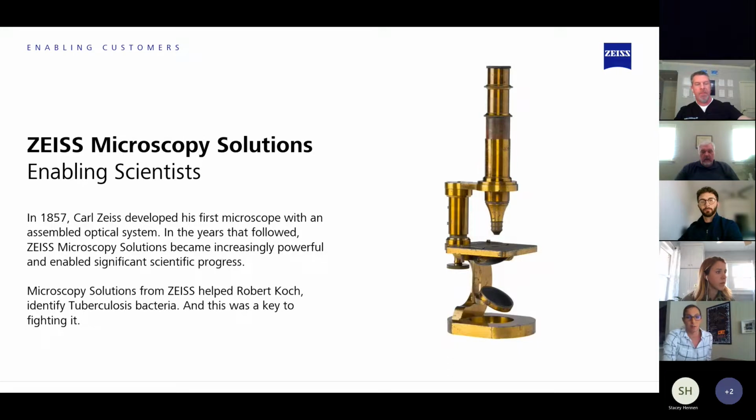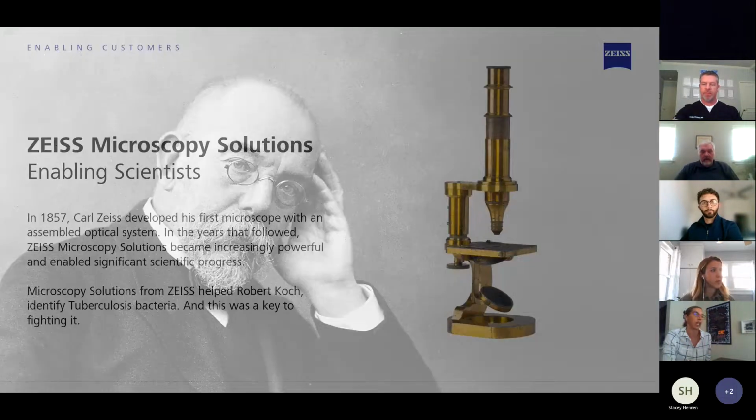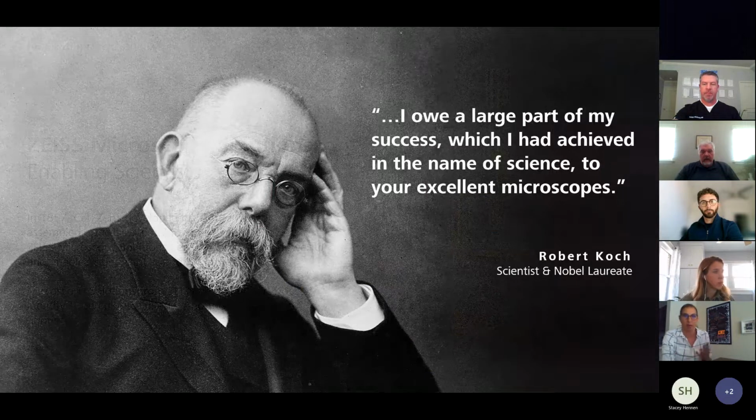And so that was basically the first microscope you can see here. It's a tabletop, or not a tabletop, a laboratory microscope. And from there, the whole optical path kind of evolved. I will share the slide deck later with everyone here. So I'm just jumping through some, so don't feel bad if you miss something.